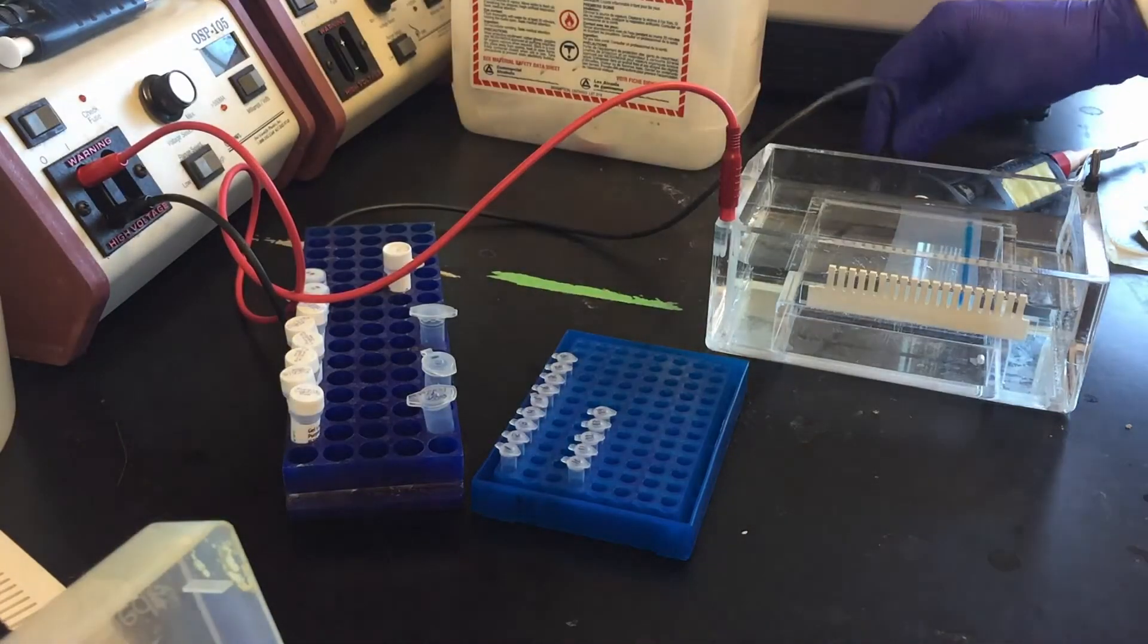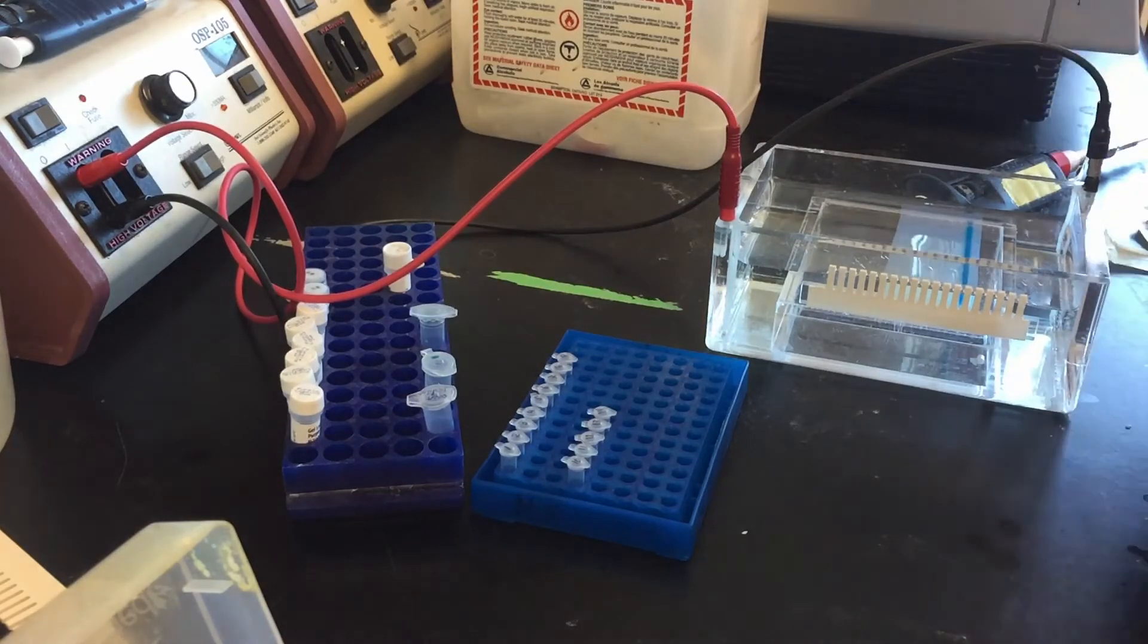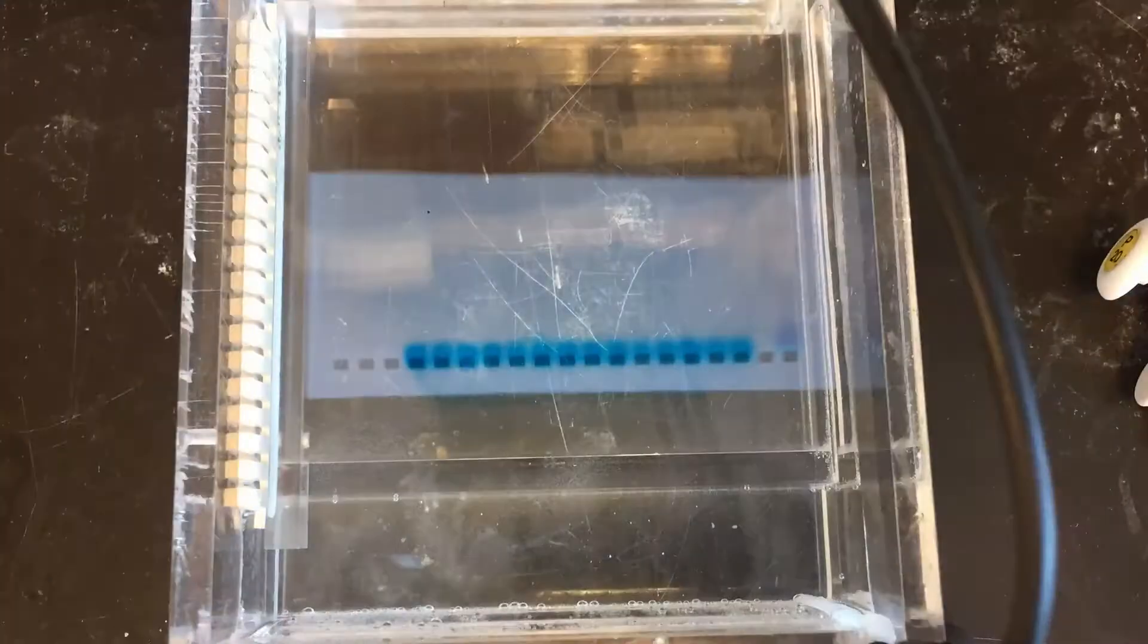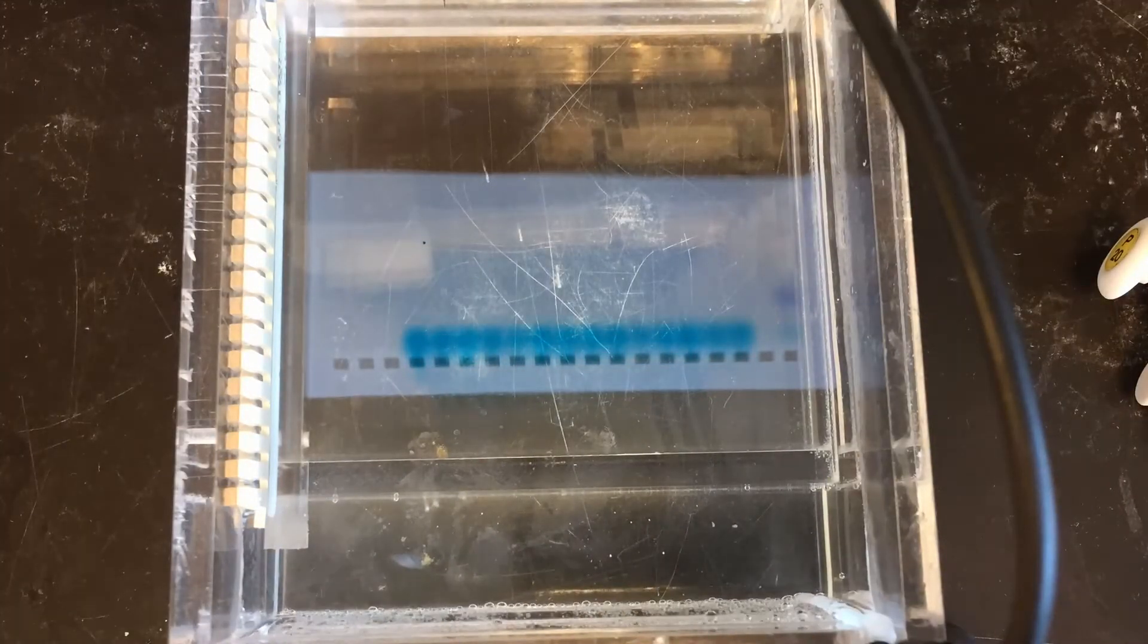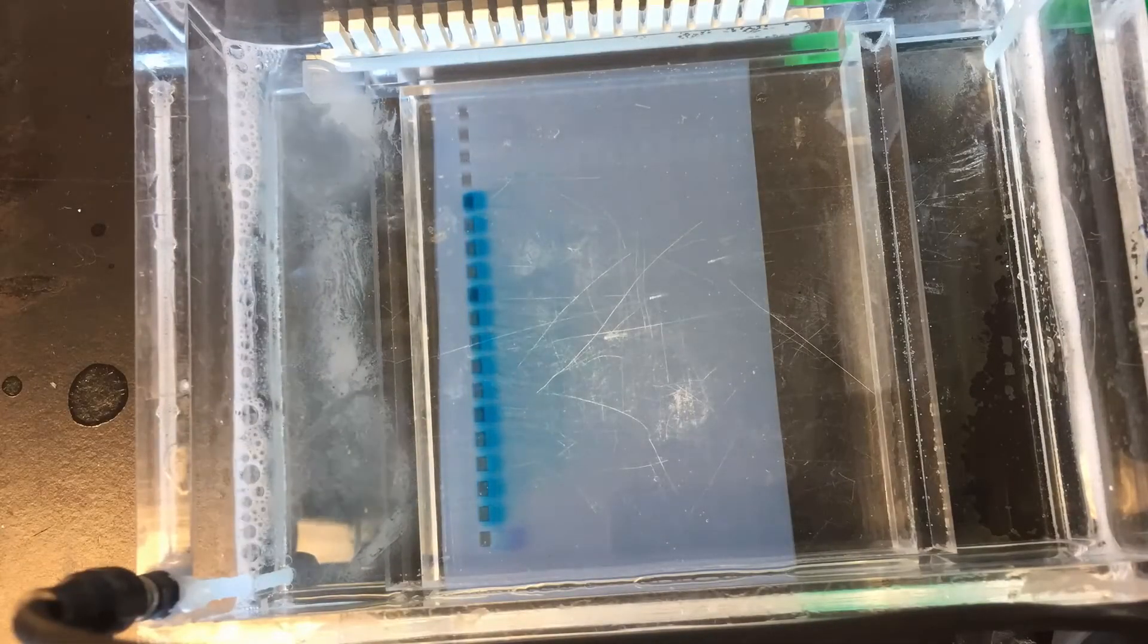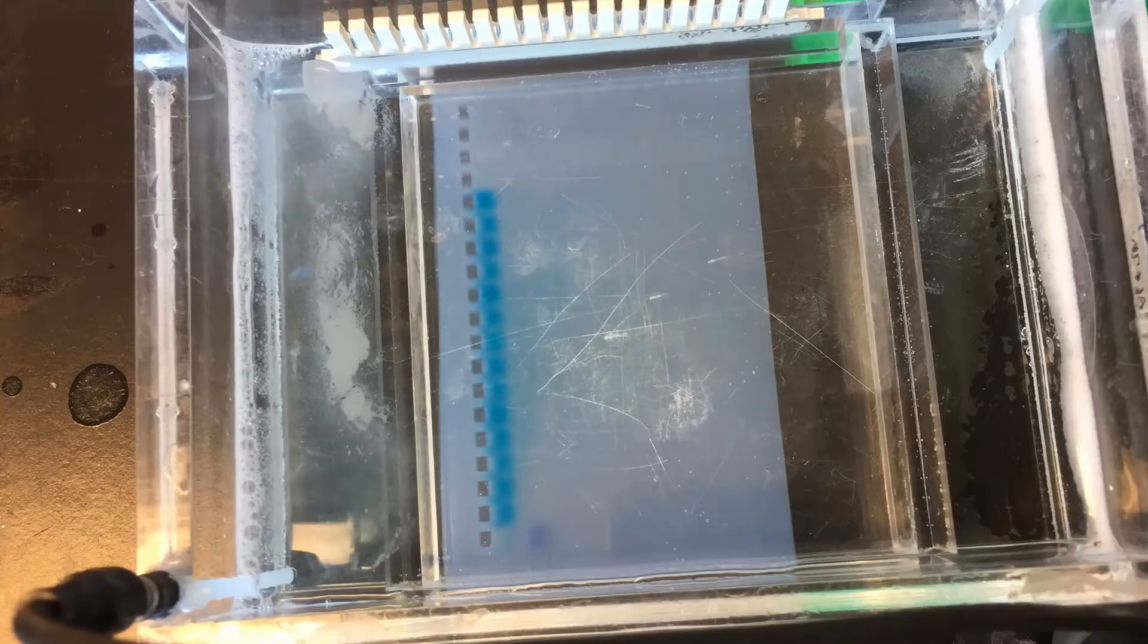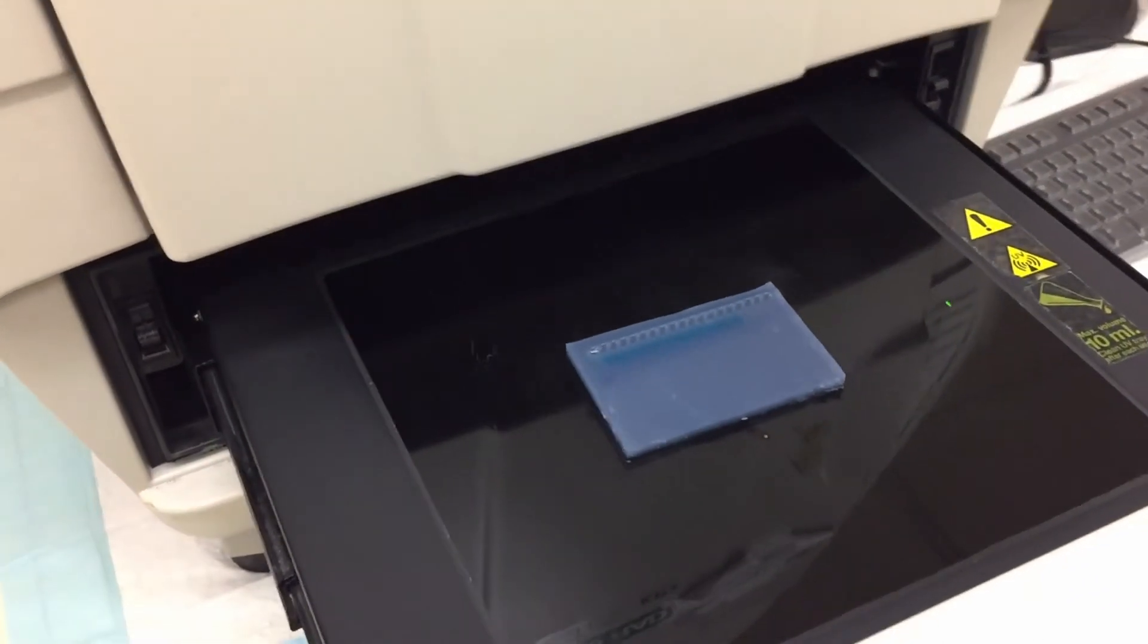When performing the electrophoresis just remember run to red or that DNA is negatively charged and like charges repel. So you want to run the DNA away from the black wire in my case. You can run the gel for about 20 minutes or until the dye is about two thirds down the gel. This depends on the size of the product you're looking for and what percent of gel you're running.